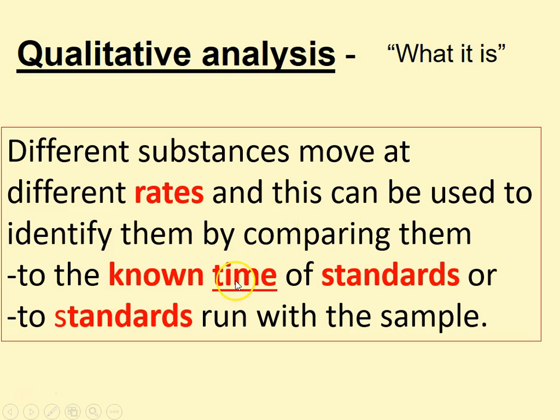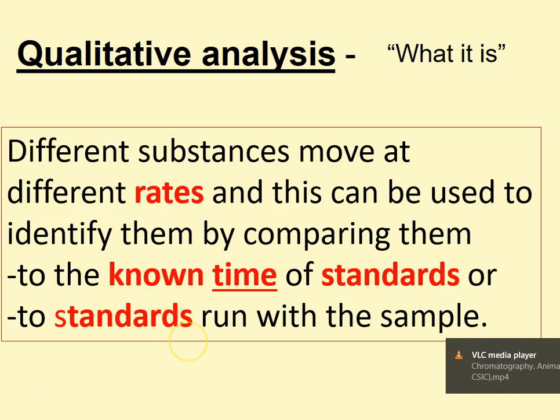You can compare it to the times of known standards, so look up a book, or you could put the standards, the chemicals that you know what they are, with your mixture and then see if you get more of that particular chemical coming out.